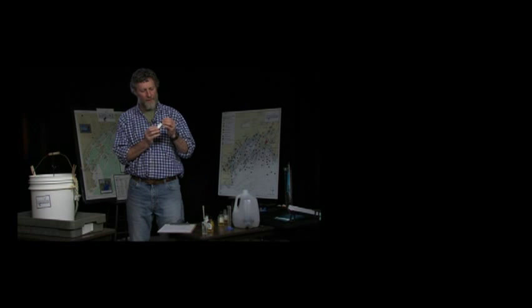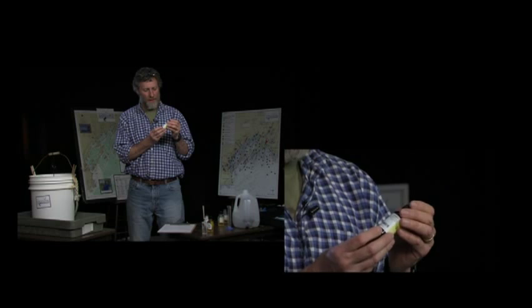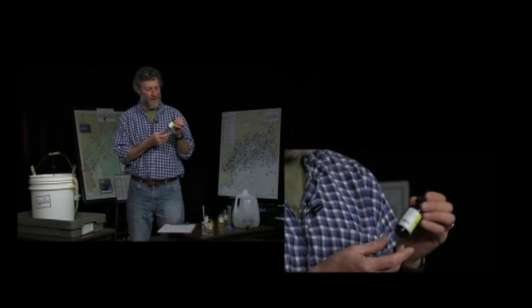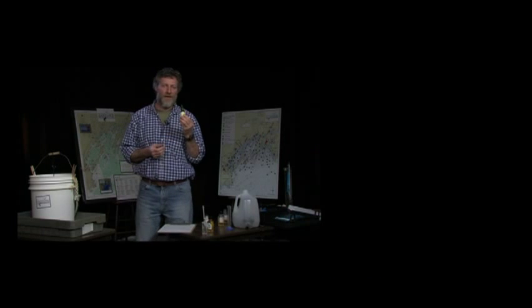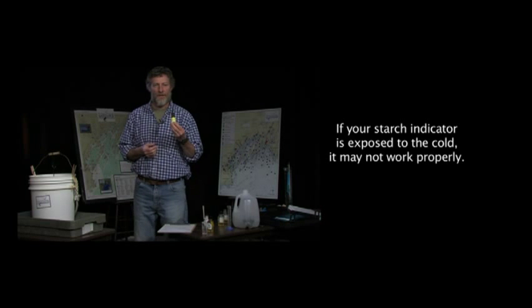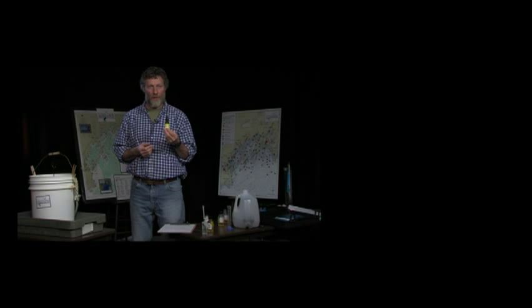And starch indicator is really just potato starch and water. There's nothing more to it. It's just starch that's been heated up enough to go into solution into the water. It's a clear liquid in the jar. But what will happen sometimes is if this tends to be in a cold environment, again, if you leave it in your car, for instance, for a couple of days, it might get cold enough for it to not necessarily freeze, but it will go out of suspension and it will become a cloudy liquid.